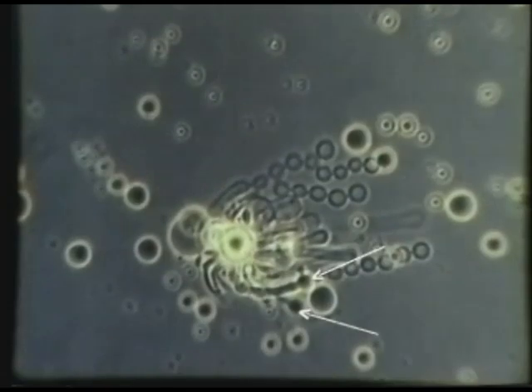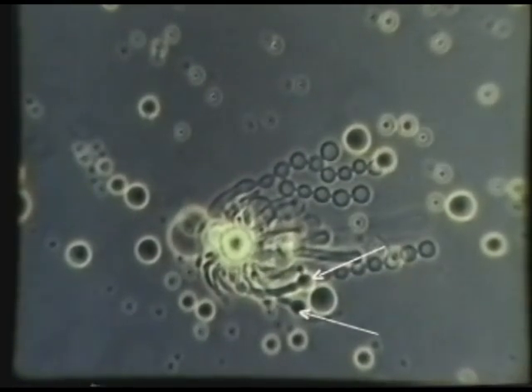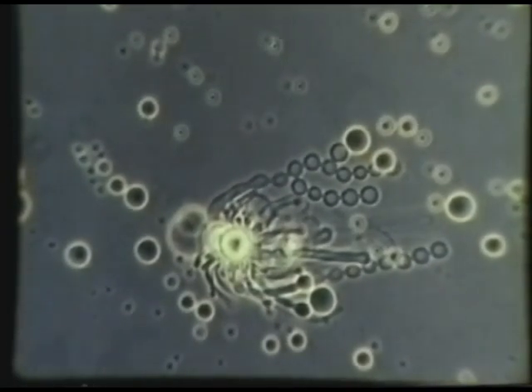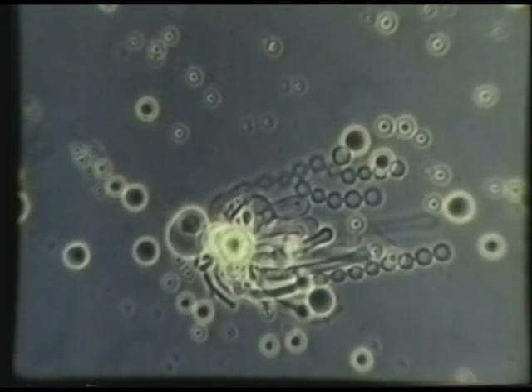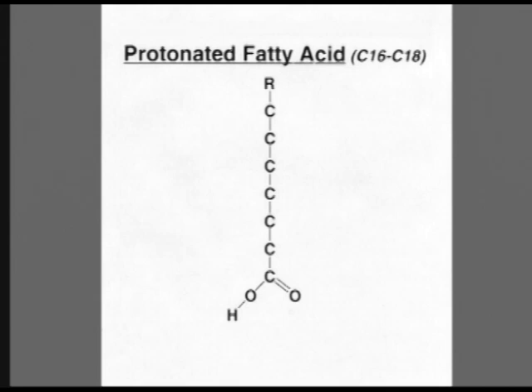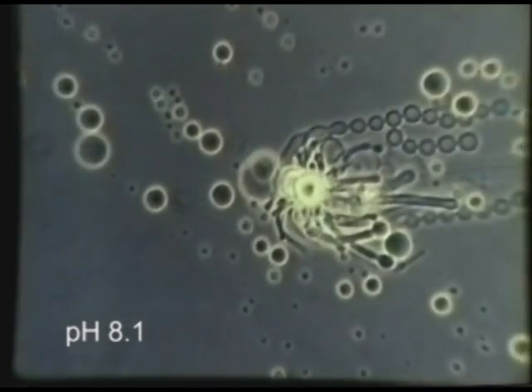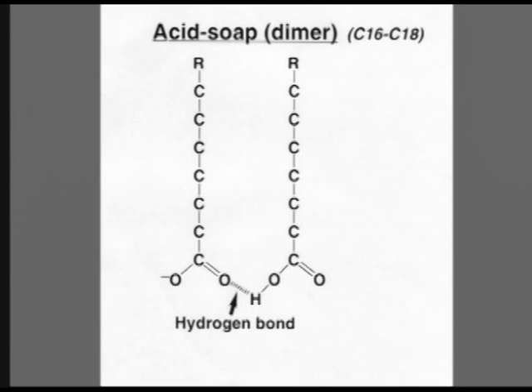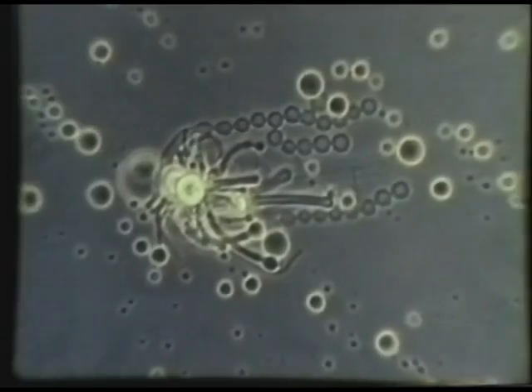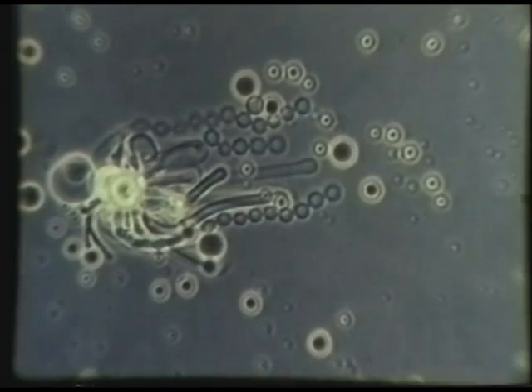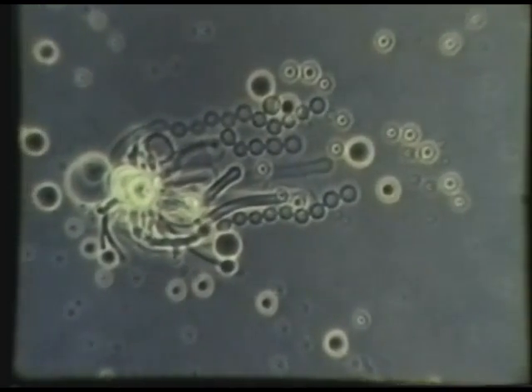Some of the myelin figures below the lipid droplet appear as long, dark structures with bulbous tips. The fatty acids produced by lipolysis are protonated, and if not ionized, they locate primarily in lenses or lipid droplets. Fatty acids are partially ionized at pH 8.1 to acid soaps, which are strongly amphipathic and located immediately at lipid-water interfaces. The growth of myelin figures when pH is increased from 6.5 to 8.1 results from accumulation of acid soaps at the lipid-water interfaces.